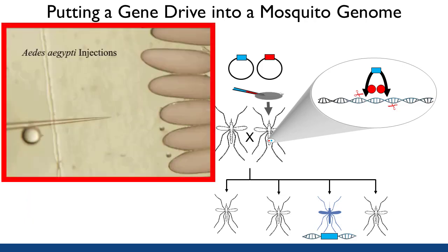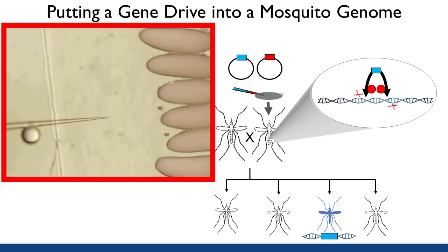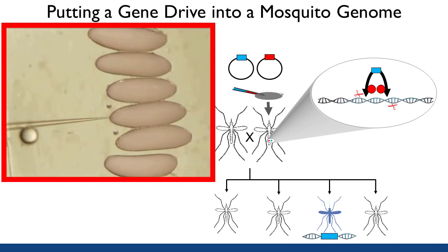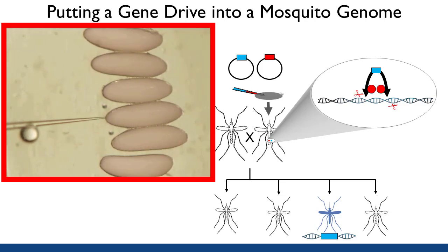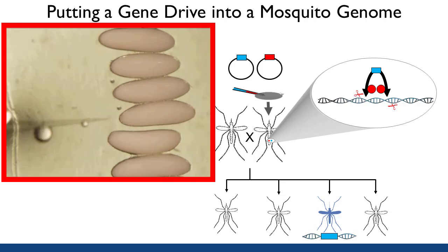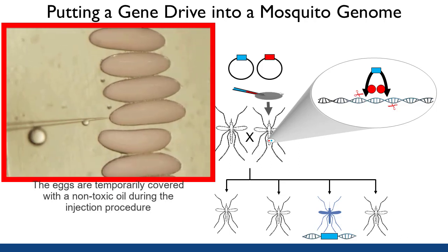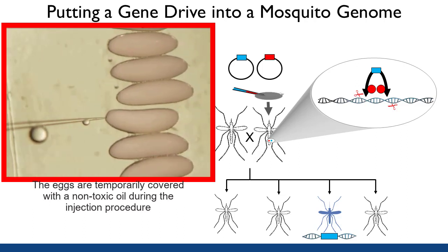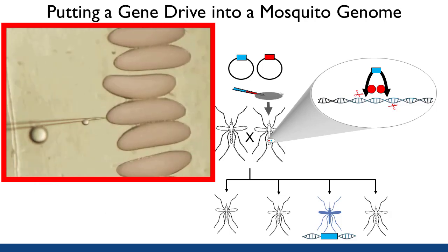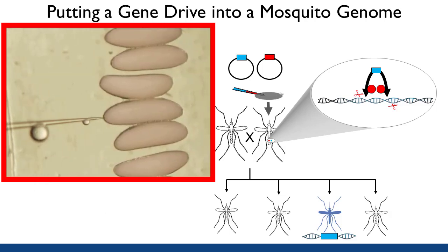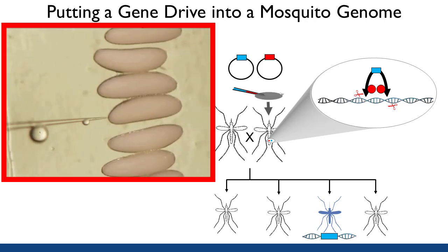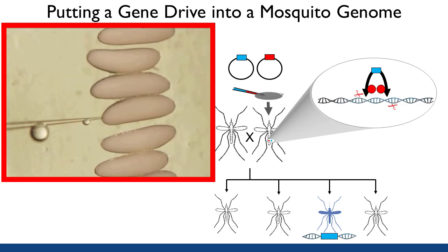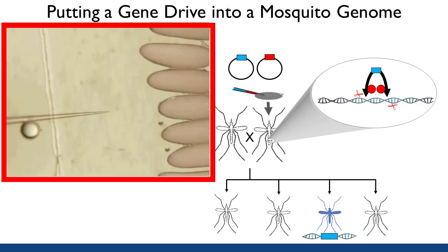This video shows the microinjection of mosquito embryos. In this case, the embryos are of the yellow fever mosquito Aedes aegypti. These eggs have just been deposited by a female and are almost white and are fairly soft. They have been collected and carefully aligned in a row for convenience. In an hour or so, these eggs will be dark black, very rigid and hard, and impossible to inject. These eggs are about the size of a lowercase i on a typical printed page.